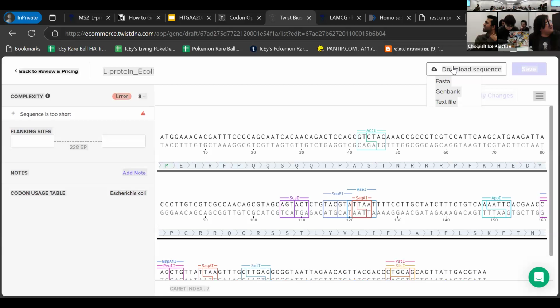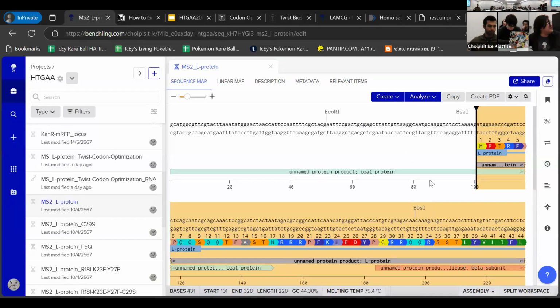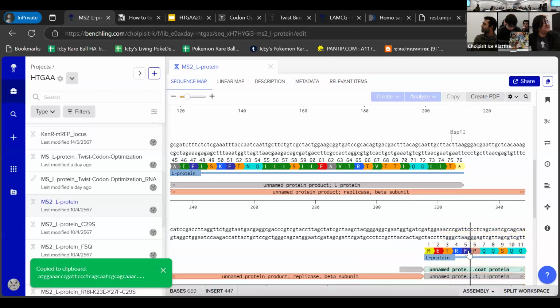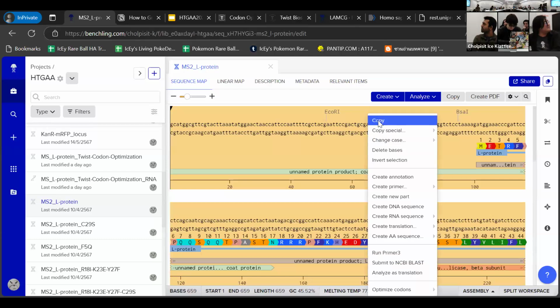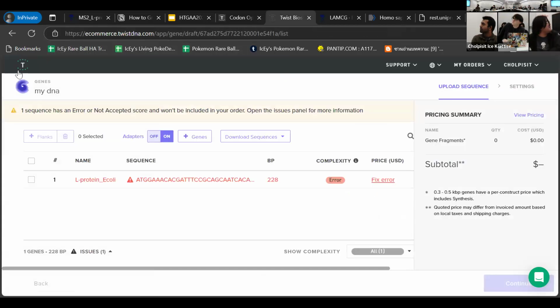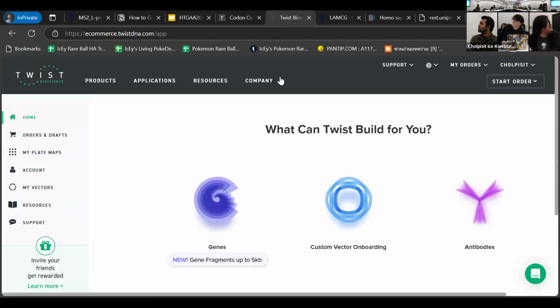So you can copy this, you can download the sequence as a FASTA file, put it into some other format, or you can just copy it into Benchling like this. Like in Benchling, let's assume that's the thing I copy. And just come back here, make it longer. And just take the whole thing. I think 600 should be long enough. I think their limitation is around maybe 300 or 500. 300 is minimum. Yeah. And then, worst case, you might have to go back to the start. Let's just go back to the start.